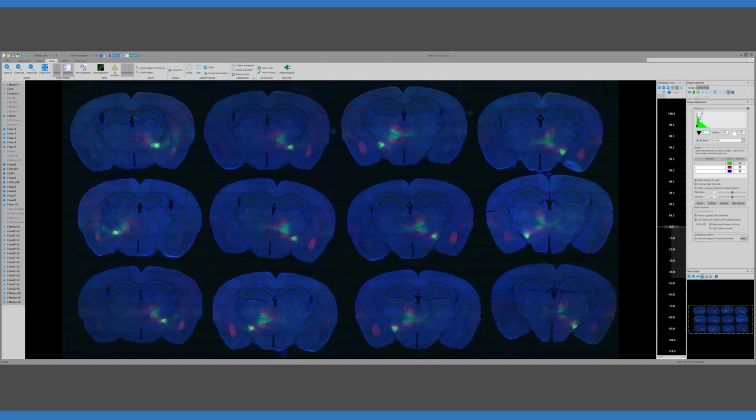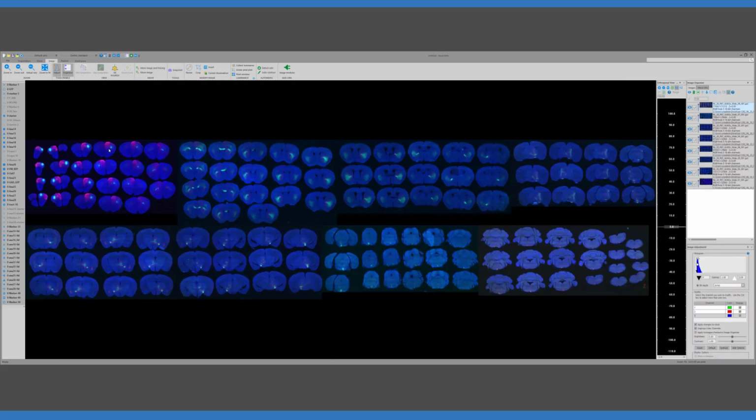Cool, thanks, Chip. Okay, so now what I want to show is that after we've gone through this and run the deep focus program on all of these slides, we end up with all 8 slides deep focused. This is showing the 8 slides for this particular brain. This is the first slide, second slide, third slide, fourth slide, fifth slide, 6, 7, 8.